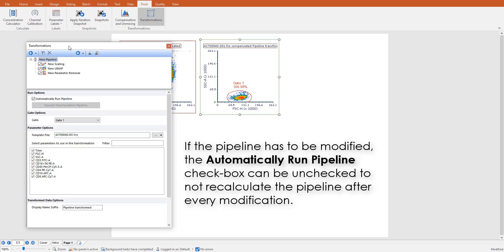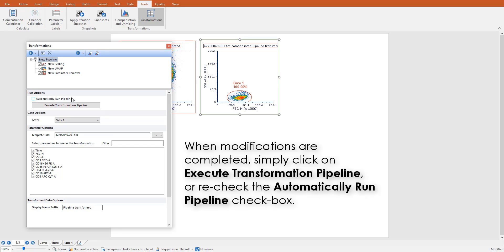If modifications need to be made to the pipeline, such as reordering steps, changing settings, or selecting parameters, the automatically run pipeline option can be temporarily unchecked to avoid the pipeline being rerun at every single change. When you are done and want to calculate the pipeline, simply click on Execute Transformation Pipeline or recheck the Automatically Run Pipeline checkbox.